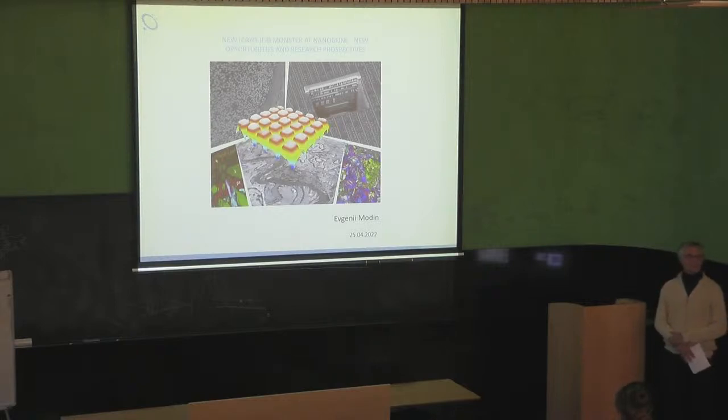And this is a very unusual beast, and we would like to introduce it to nanoGUNE and to the Basque community. The story started a few years ago when we started to collaborate with Nicola Abrescia from bioGUNE, who is a group leader there, and started to think about going in the direction of cryo-focused ion beam machining, which is a super fancy topic now in the community because of uprising cellular cryotomography.